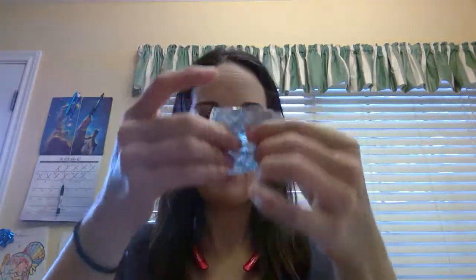You can see that it is very reflective, and it was able to be shaped into this form. If you took a hammer to it, it would flatten even more. It would not break into pieces. And when I use my conductivity tester, see, it does light up the conductivity tester. And that was element number 1. So fill out your chart for element number 1.